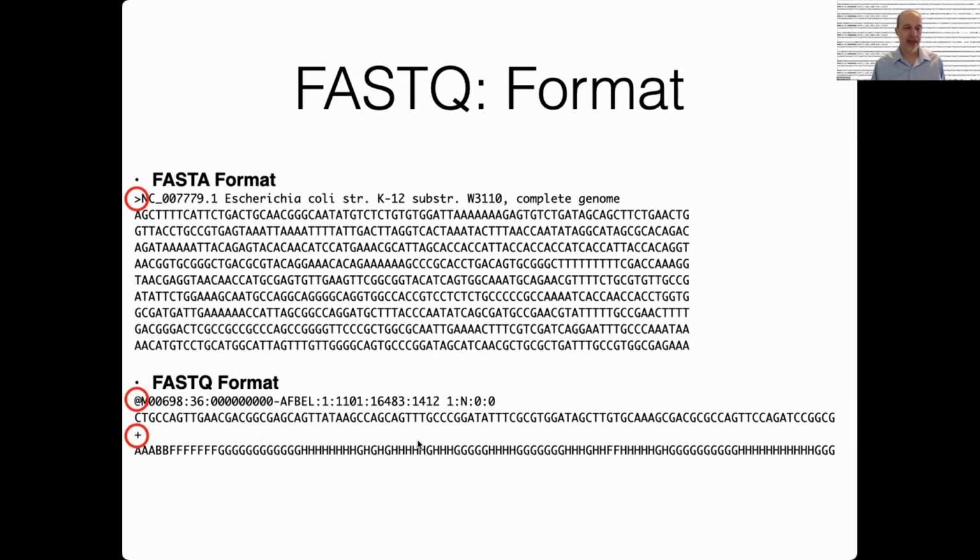And there's this thing here, and the FASTQ format says it has to start with a plus. It can either have nothing after the plus, or it can repeat the header after the plus. Either of those is fine. It's pretty common to just have nothing, because why do you need to repeat the header? But some databases, like the sequence database that's run by the NCBI, part of the National Institutes of Health, if you download sequence from it, they will actually repeat the header here.